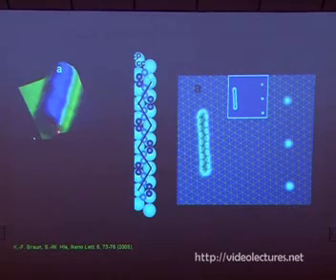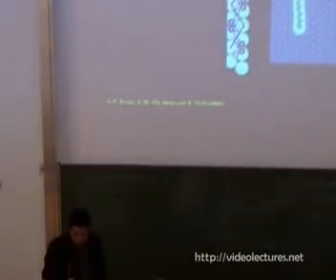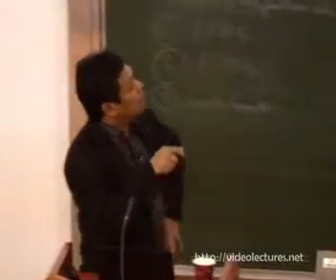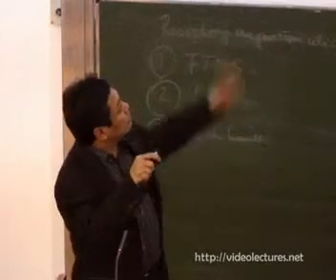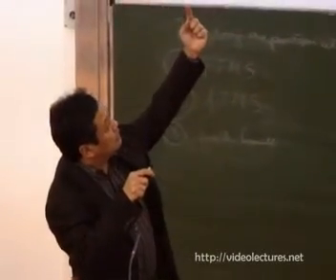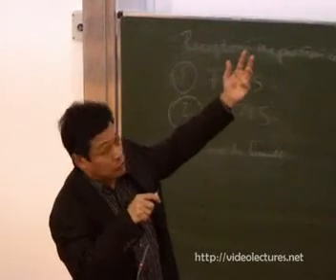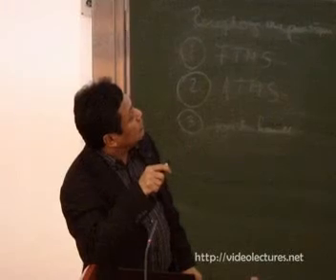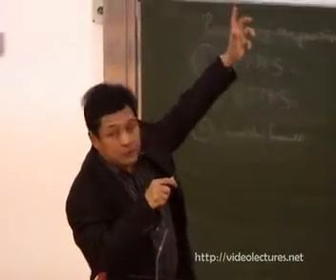Now, this is a close-up look. Again, it shows the single molecule, showing the wiggling. If that is true, then if we move the molecule half of the atomic distance forward or backward, in this case backward, it will switch. For example, the substrate has FCC and HCP sites. If we move this half the atom distance down, then the bridge site will become the top site, and the top site will become the bridge site. So the wiggle should change to the opposite wiggle.